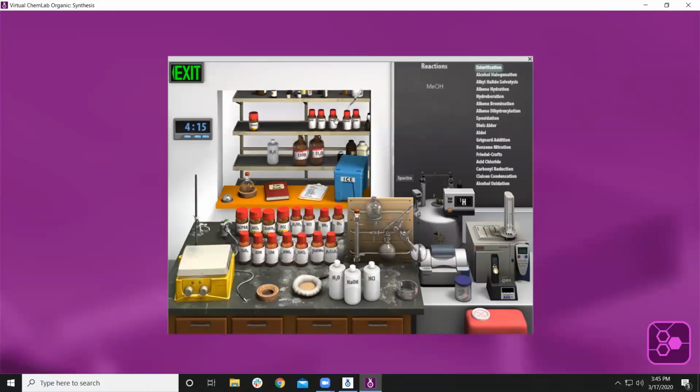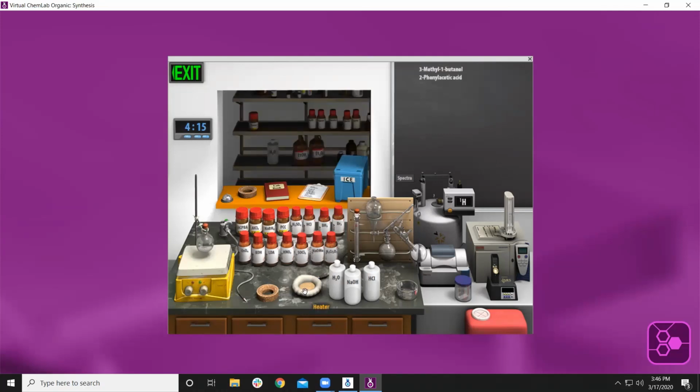So let's do this for real and take it to the product. So I'm just going to go back and start my reaction. I'm going to go add my heat, go add my condenser, go add my nitrogen. You can also use ice. So we have all these reactions that they run on ice. You can run it at room temperature.